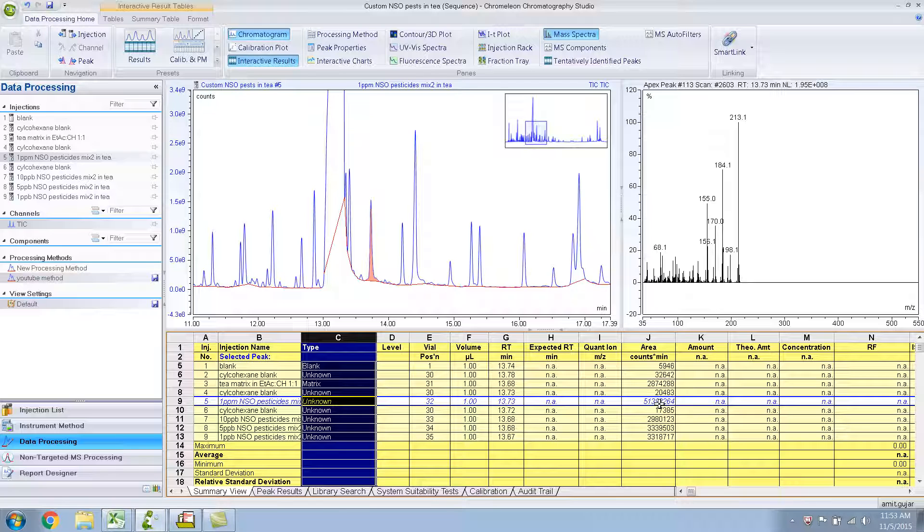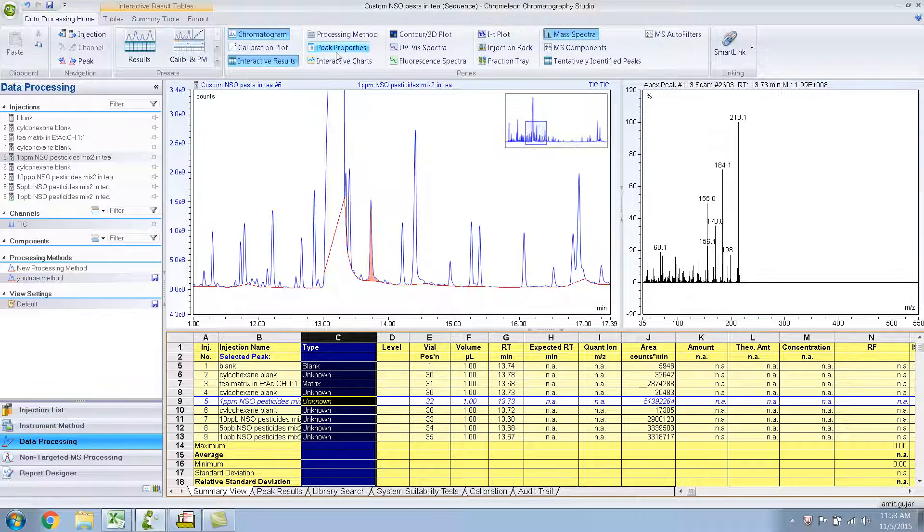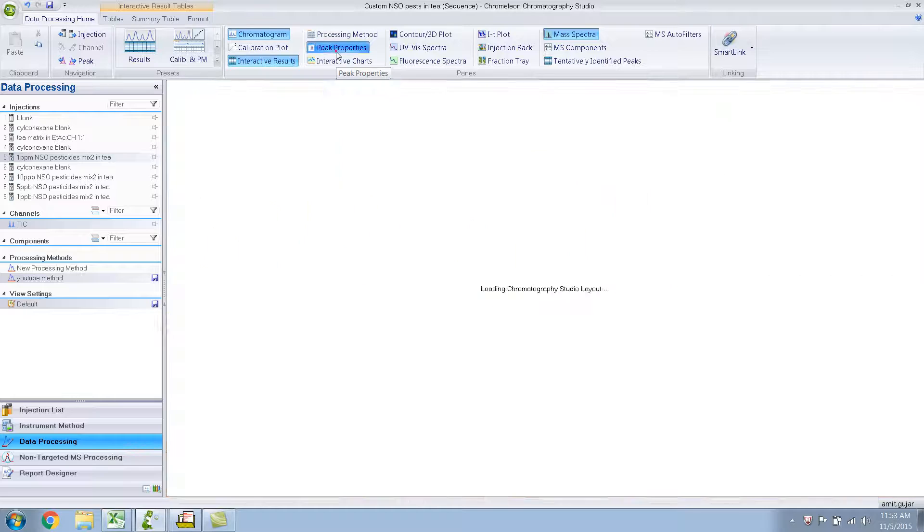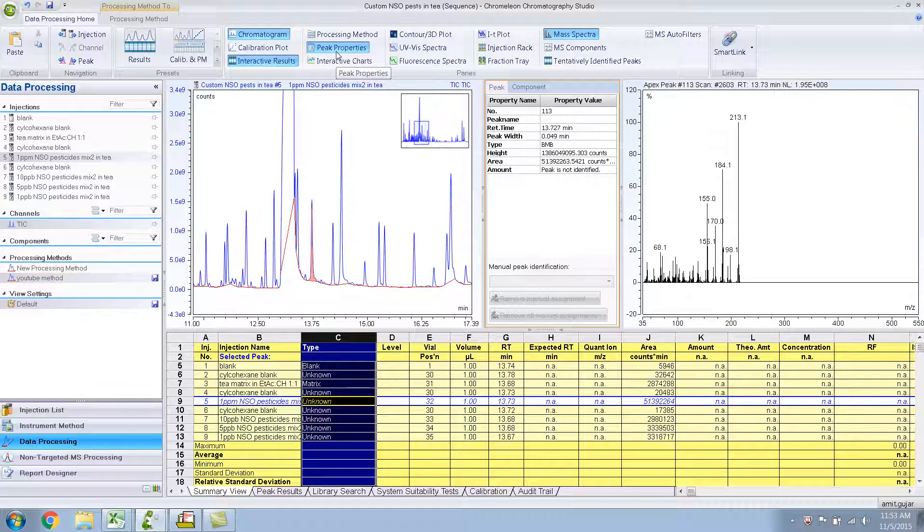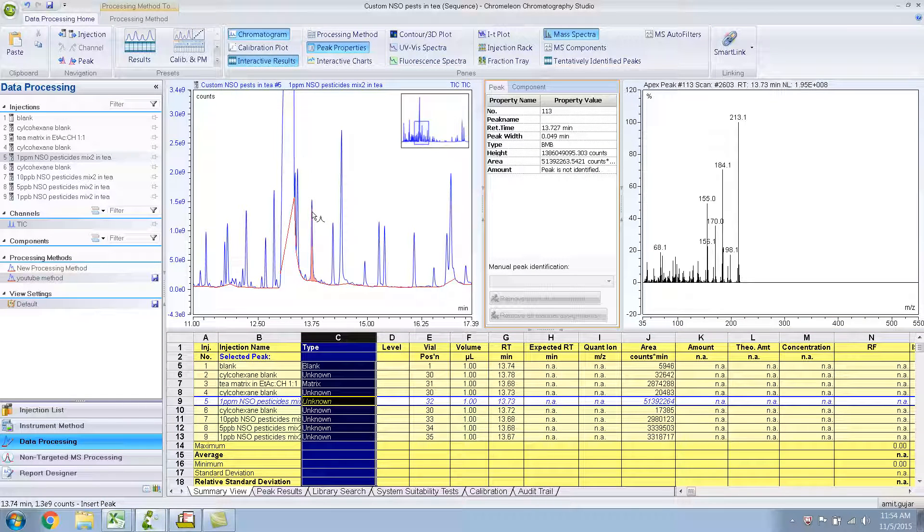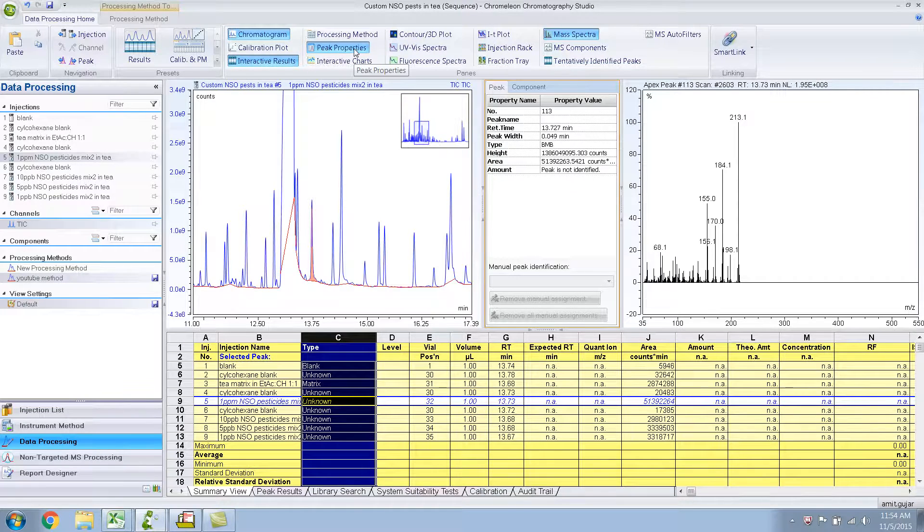Another way to find out the area is click on this button which is Peak Properties and it will give you peak properties for that particular, for the highlighted peak. The area is the same, the retention time, etc. Let me unclick this.